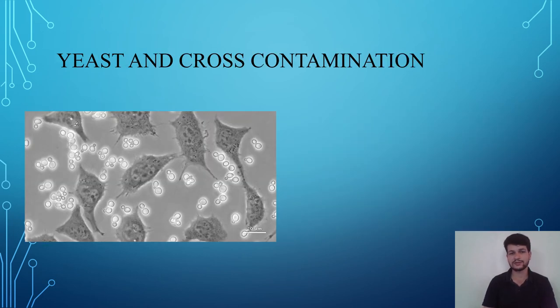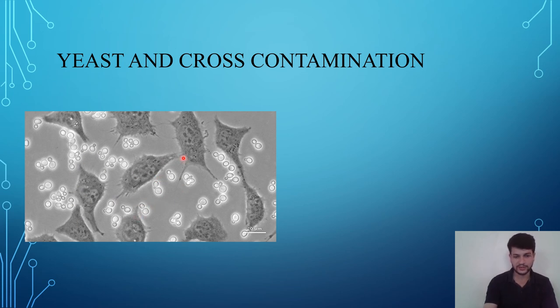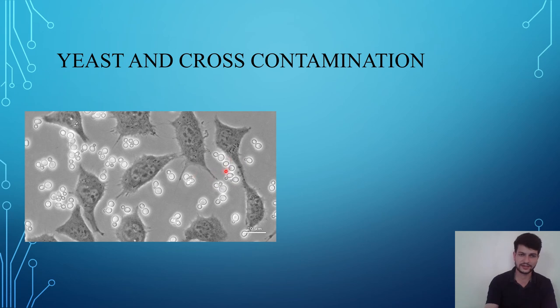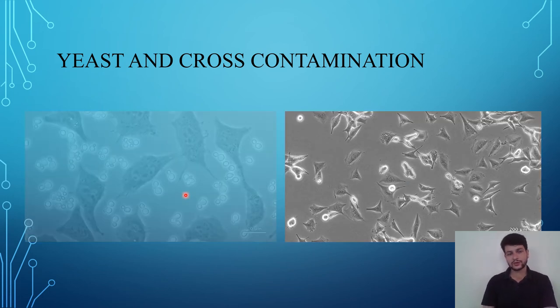If there is yeast contamination, yeast looks like these budding particles. If you see these buds or particles you have to discard your cells. Bacterial and fungal contamination are very easy to identify by eye because the media looks very messy. With yeast contamination, sometimes a person may confuse them with cells that have not yet adhered to the plate, but if you see them as buds it is definitely yeast contamination.